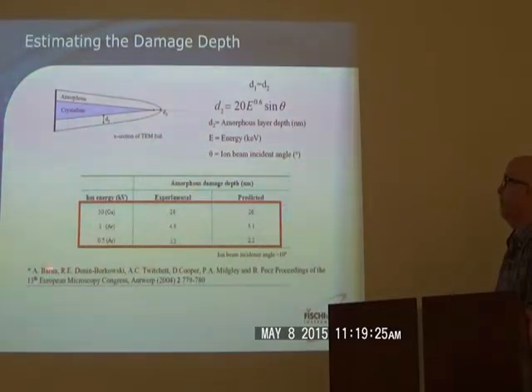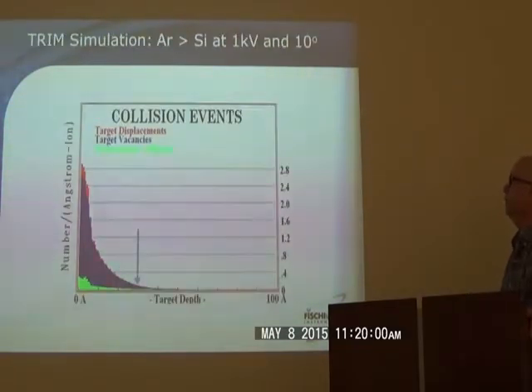Here's one that's favored by Barna, who's really famous in the whole theory of sputtering and ion milling samples. For a given ion and a given material, this is pretty close in terms of what you could predict to what you would observe in the TEM. So after 0.5 kilovolt argon ion milling, experimentally they found a 2 nanometer thick layer, and they had predicted 2.2, so not far off. Next slide, please. That's a 10 degree angle in terms of incident angle.